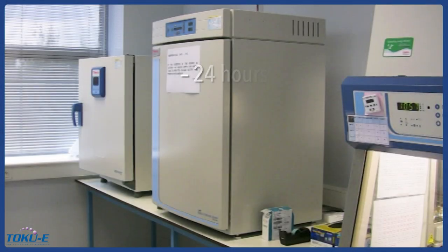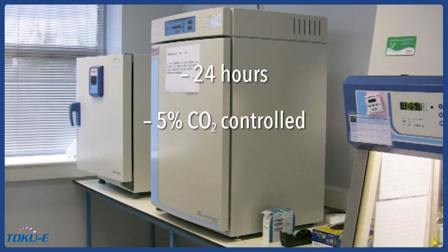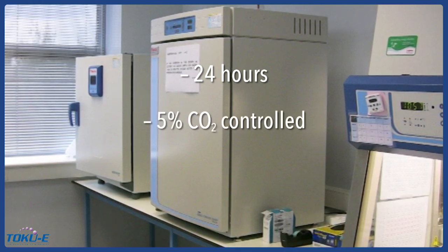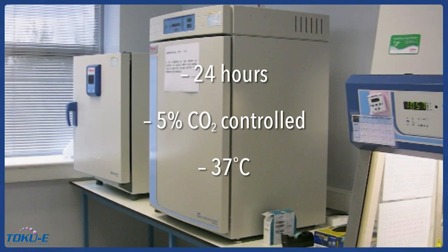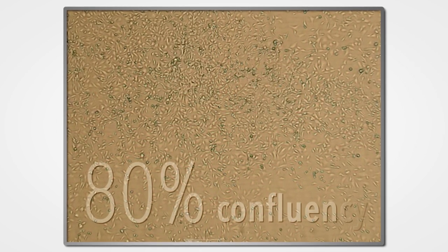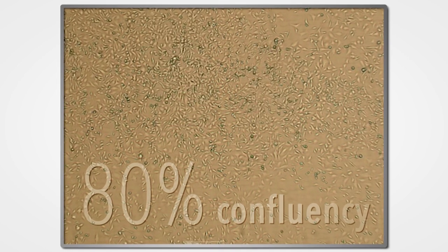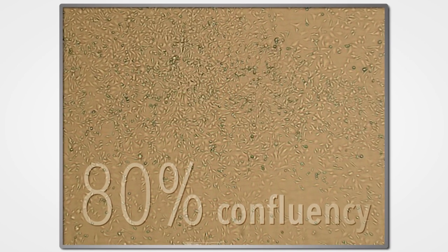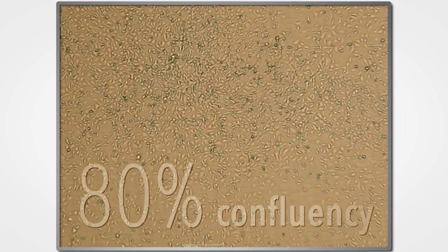Place the 24-well plate for 24 hours in a 5% CO2-controlled incubator at 37 degrees Celsius. After 24 hours of incubation, each of the three wells should appear to be 80% confluent. This cell density is ideal for transfection as the cells are in the proliferation stage and growing exponentially.